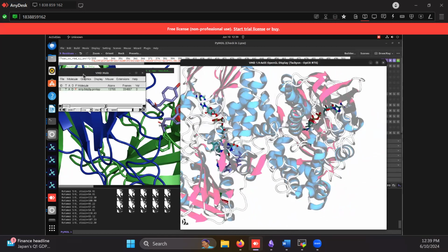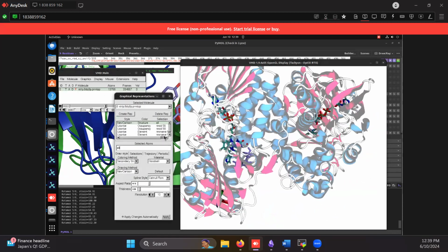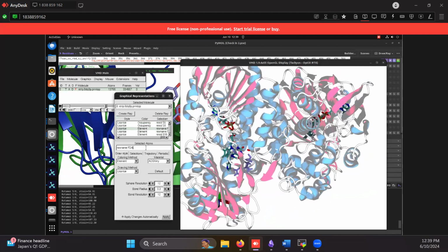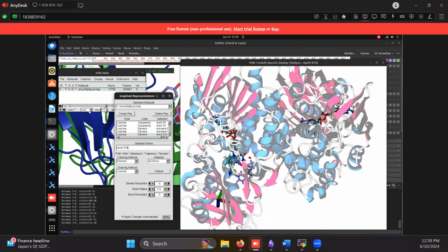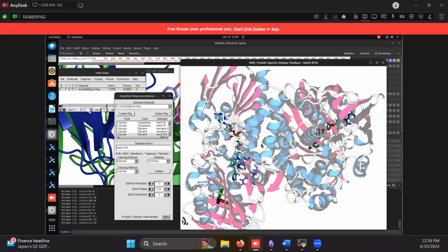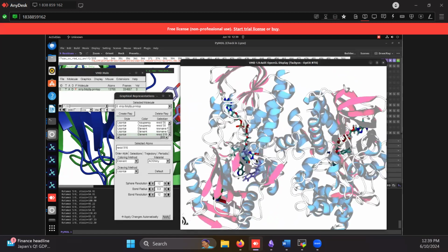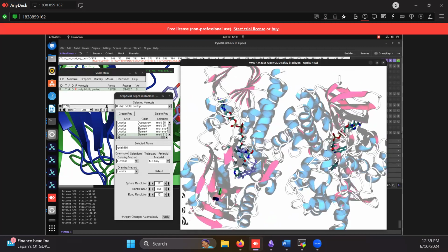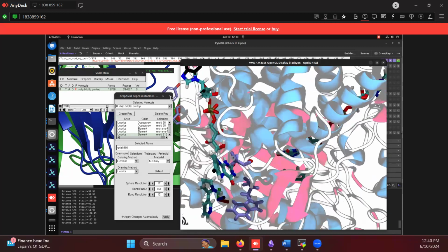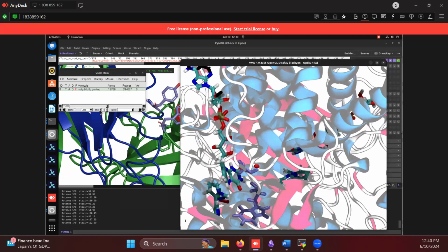But you can specify specific residues, and for this one, I have specified the same residue ID 916, which we're looking at in PyMol, and I want to look at how this enters and reaches the flavin. So this is a good way, using GlassBubble and coloring the ligands differently, to look at the trajectory visually. It's jittery because I've set this to 10. Okay, this should be much better.